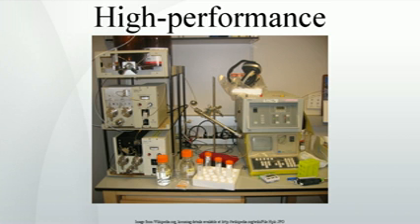In isocratic elution, the selectivity does not change if the column dimensions, length and inner diameter, change, that is, the peaks elute in the same order. In gradient elution, the elution order may change as the dimensions or flow rate change. The driving force in reversed phase chromatography originates in the high order of the water structure. The role of the organic component of the mobile phase is to reduce this high order and thus reduce the retarding strength of the aqueous component.